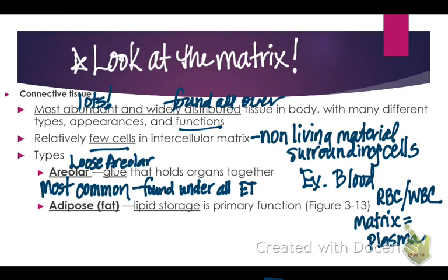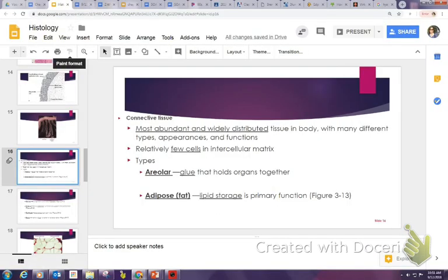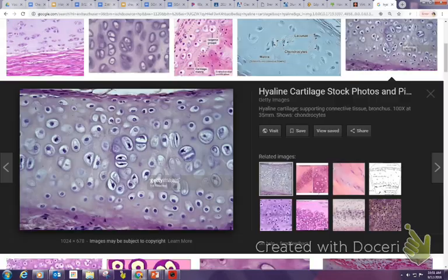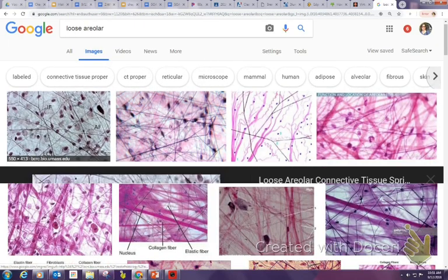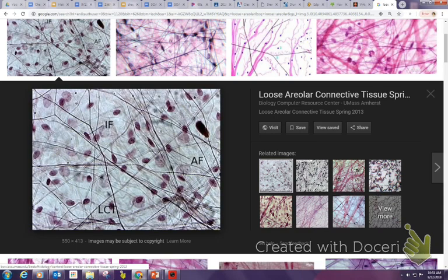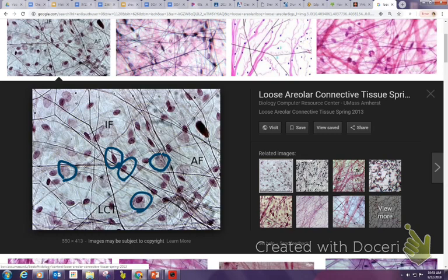In loose areolar connective tissue you're going to see dots of cells and lots of fibers in between. Looking at the picture, you can see the cells and identify the nucleus versus the cell — the more darkly staining nucleus and then the whole cell around it. The nucleus itself may be out of view. This tissue doesn't look organized at all — you see fibers running in all different directions.